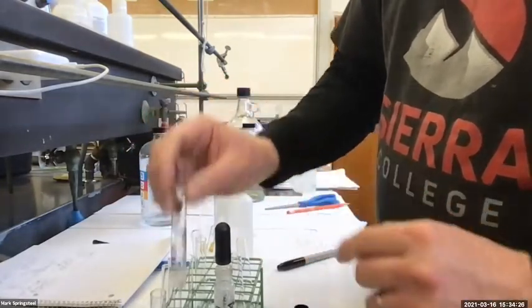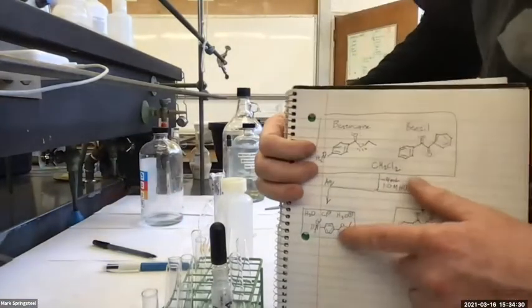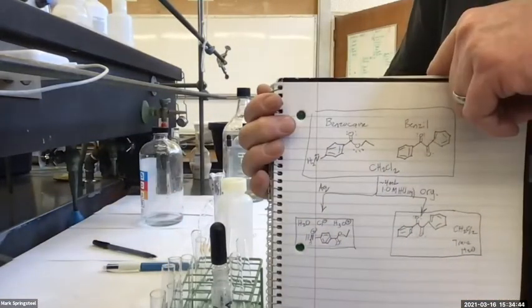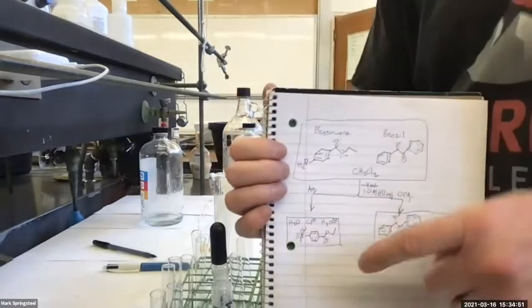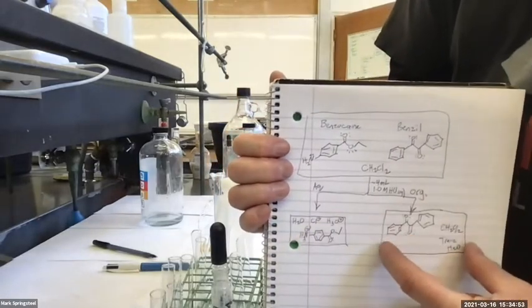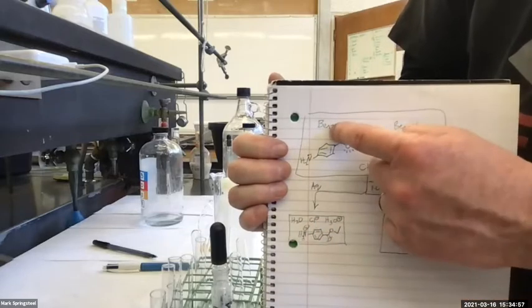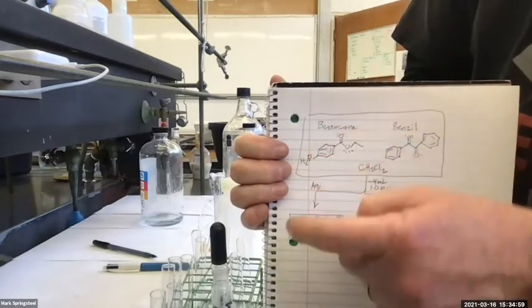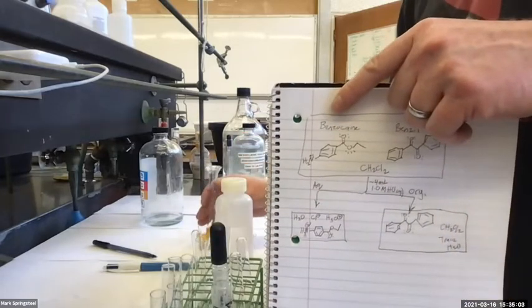So I've got my aqueous now, and I know it's aqueous. I think the ammonium's in there. What can I do to prove that it's in there? Should we extract it one more time? Oh, before I extract it, I want to check this guy. When you say extract it, I think you mean the organic layer, but yeah. I'm going to pause there. I want to prove that the amine that was in the original flask came over here as an ammonium. How can I prove it?